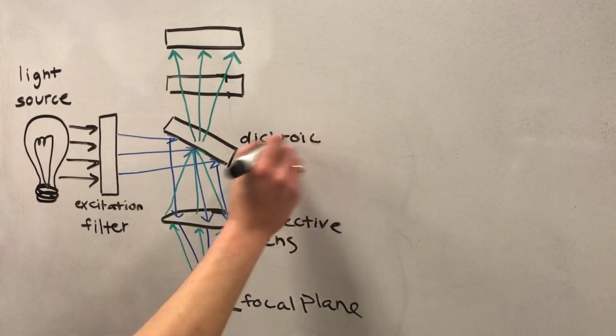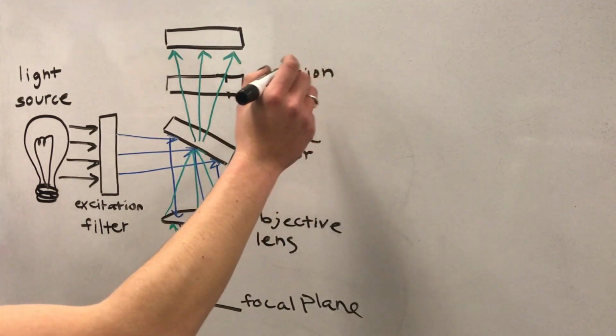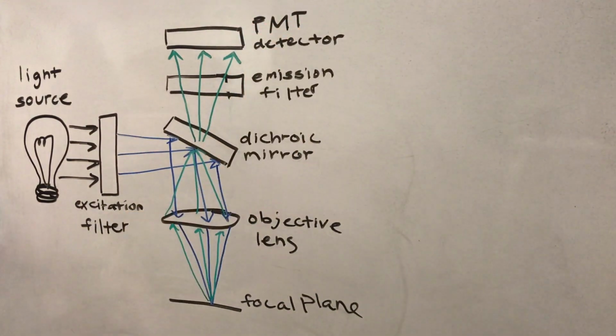However, in samples over 2 micrometers thick, there is a noticeable out-of-focus flare due to secondary fluorescence emitted from regions of the specimen that aren't of interest. This interferes with the resolution of features that are in focus.